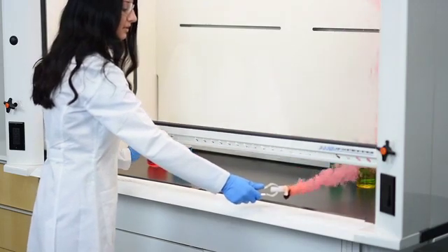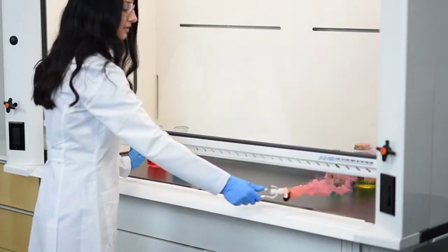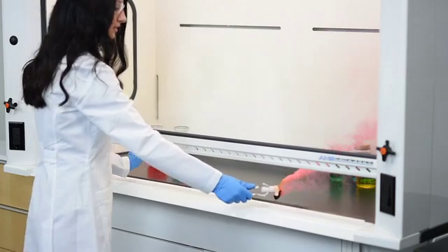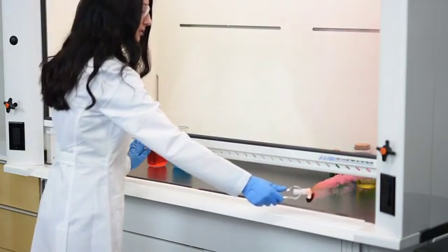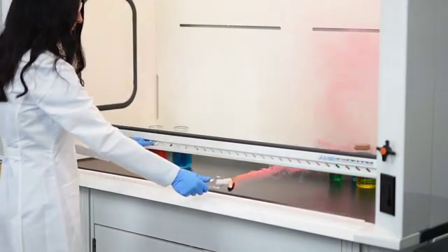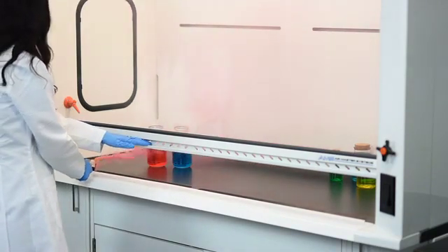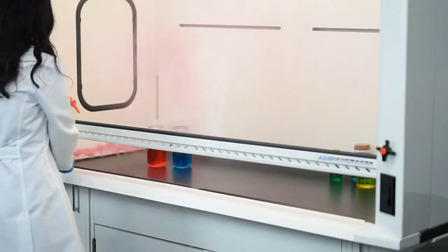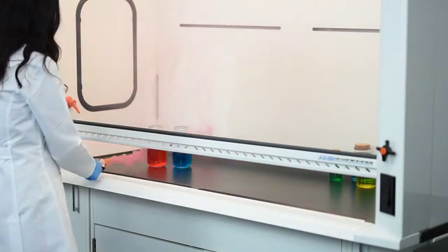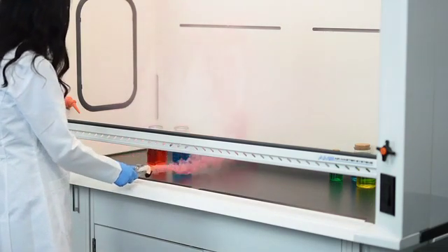A very important thing to keep in mind is that the room has to have the proper balance for the correct airflow through the fume hood. If your room's airflow is not balanced correctly, you will not get the performance out of your fume hood that you desire. So simply stated, an adequate amount of air must enter the room in order to exit the room at the correct amount of airflow that you are seeking.